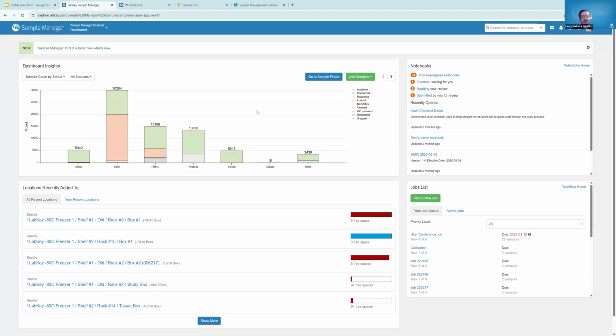We do try to upgrade in buckets of 5 because that's usually when you get the next discount. Because the more users you have, we do discount per user to make it a little bit easier. So you can do that at any point in time. We prorate it, and we try to work very closely with you on that.